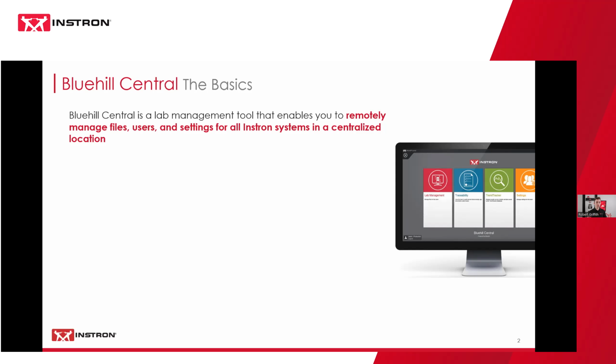The short summary of how this works is behind the scenes of Bluehill Universal there's a server that houses all of those Instron files. Any users of your Bluehill software, as well as any settings that can be managed for your Instron system, are all housed and managed and stored on this server. And all that information is then communicated to the Bluehill Universal installations in your lab. And then you can access and manage the same information from our new Bluehill Central application, which is usually installed on your personal laptop, or maybe a centralized computer or desktop PC within the lab.